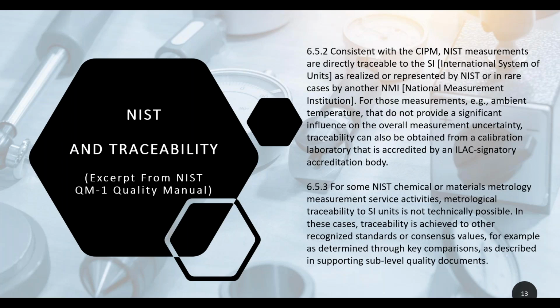So in the case of, let's say, pH meters and conductivity, we can calibrate the meters themselves, but once you have the probes and you put them into the different solutions, the solutions are not technically a traceable measurement, because as soon as they're opened up, there's too many things going on and the solutions are not traceable. So what we have is a consensus agreement between our lab and the manufacturing lab or whomever for those chemical devices. It's our best guess that this is what it is.